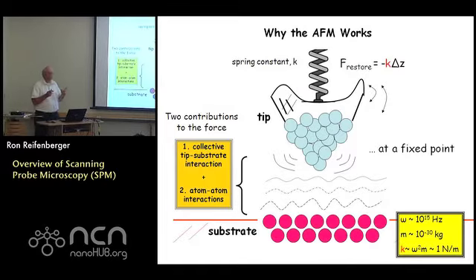In addition, there's a secondary force, which is the force that all the atoms in the tip feel from all the atoms down here. When you're far away, this collective force between the tip and the substrate tends to dominate, and that force is often referred to in the literature as a van der Waals force.